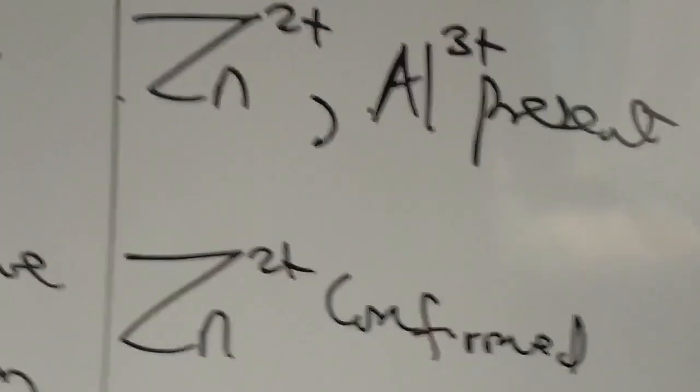Okay, now we are holding another unknown salt, which is also colorless in solution like the one we did previously. Let's call this unknown salt E. So we are trying to find the cation, or the metal, present in this salt solution. This represents a little quantity, or 2 cm cube, of this solution. We're going to do the test on this sample obtained from solution E.